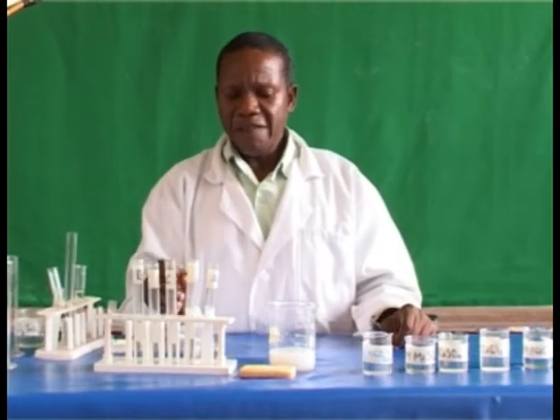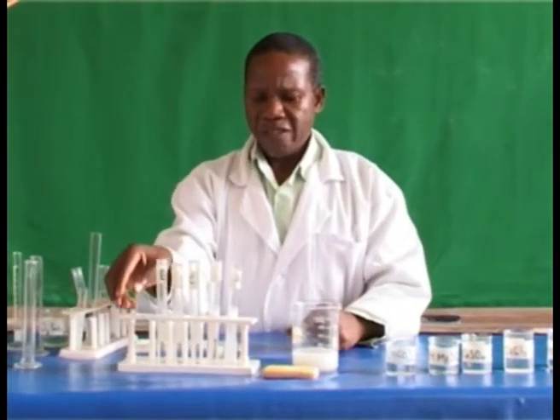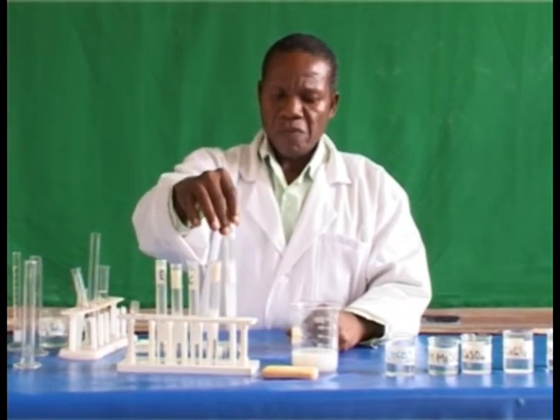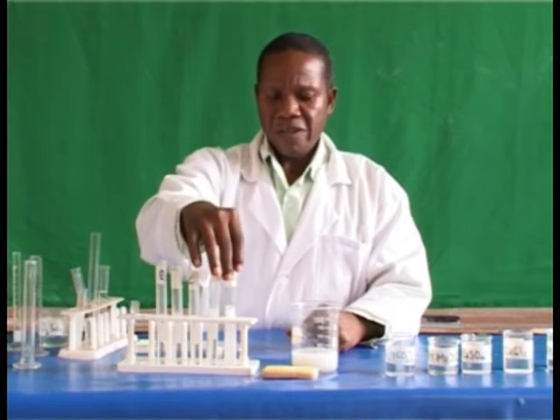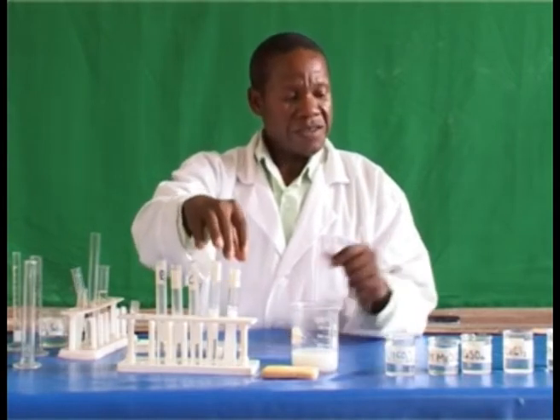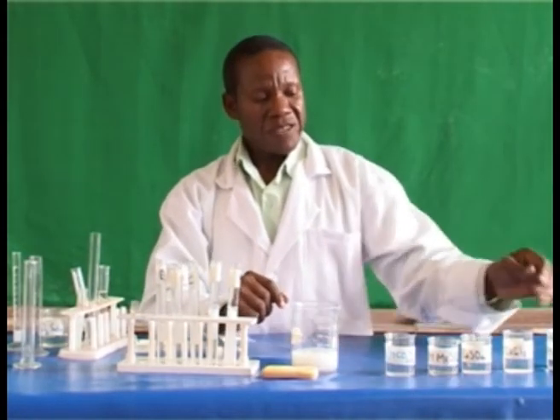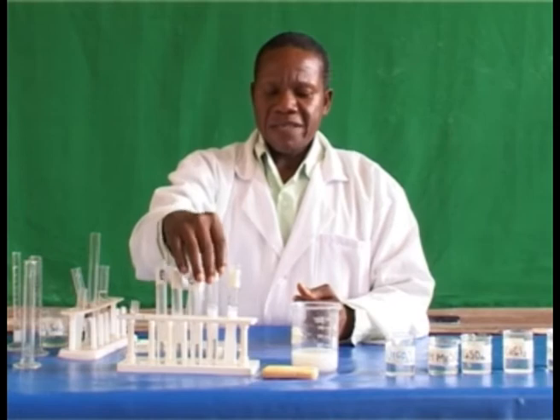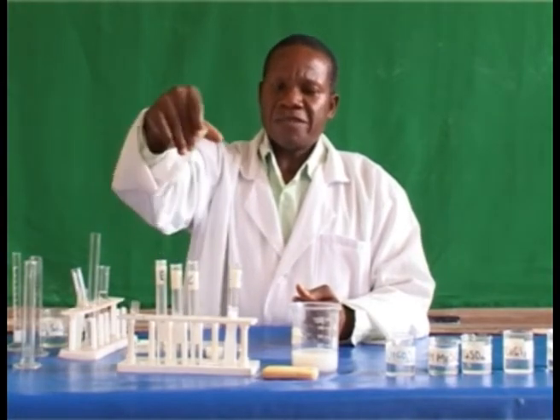Now, from these 5 test tubes in the rack here, we have observed that in the first test tube, lather is formed, and this first test tube A contains sodium chloride. Therefore, sodium ion, which is present in the sodium chloride solution, does not affect the water, therefore does not cause the hardness of water. In the other 4 test tubes, which contain soluble calcium ion or magnesium ion, scum is formed.